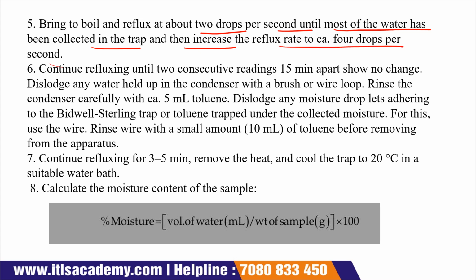This process will continue until we get two successive readings, 15 minutes apart, which show there is no change.